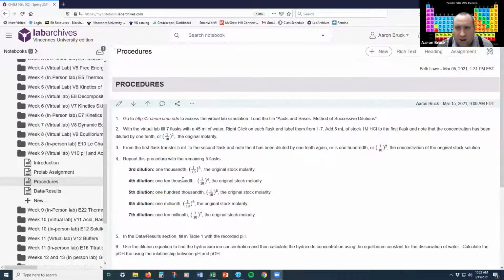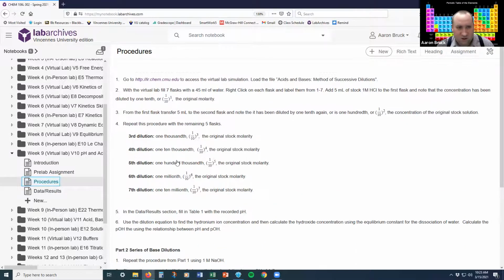So we're going to start off by going here to LabArchives as usual. Now, in the previous video, I already covered the pre-lab and walked you through a little bit of the theoretical constructs. If you haven't watched that pre-lab video yet, I would strongly encourage you to do so. It's on the same channel in the same playlist here in Chem 106 Lab. We're concerned today with the procedures.